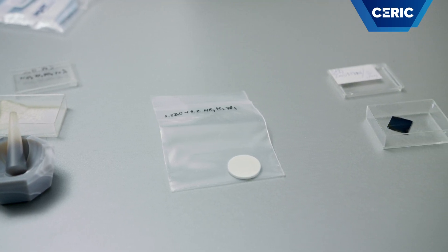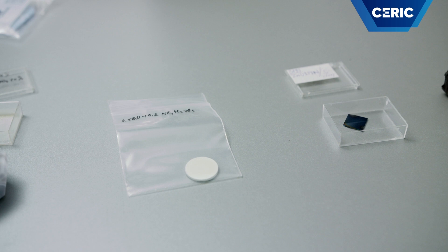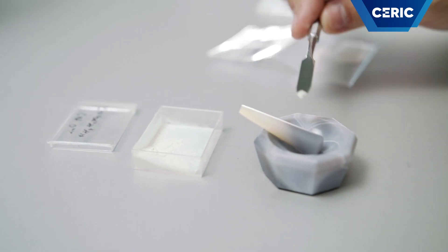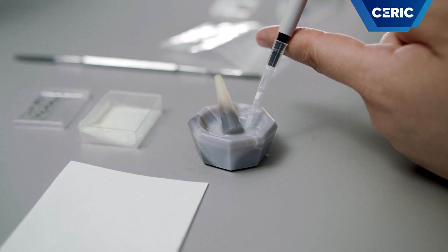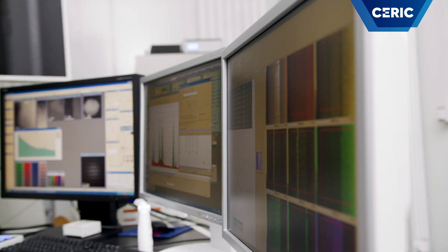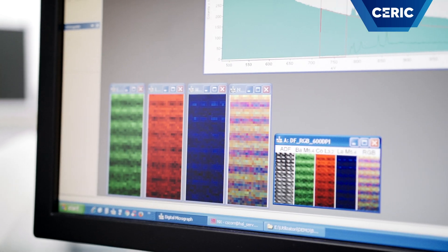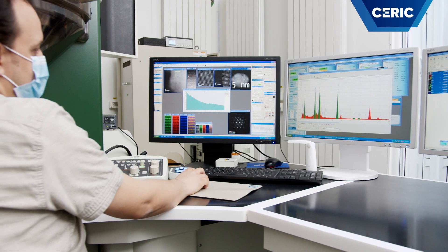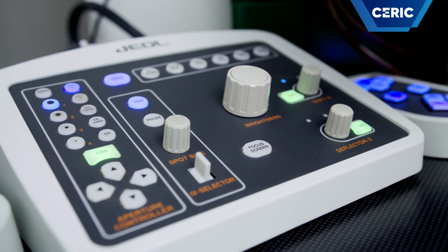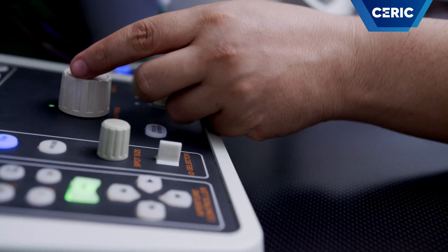HR-TEM addresses solid-state crystalline materials in various morphologies: powders, thin or thick layers on various substrates, or bulk materials like ceramics or metallic alloys. Beside the typical imaging and electron diffraction capabilities of a TEM, nowadays instruments are complemented with highly sensitive analytical systems, like the EDS and EEL spectrometers. Apart from HR-TEM imaging, the instrument installed in our laboratory offers several other imaging, analytical and combined working modes.